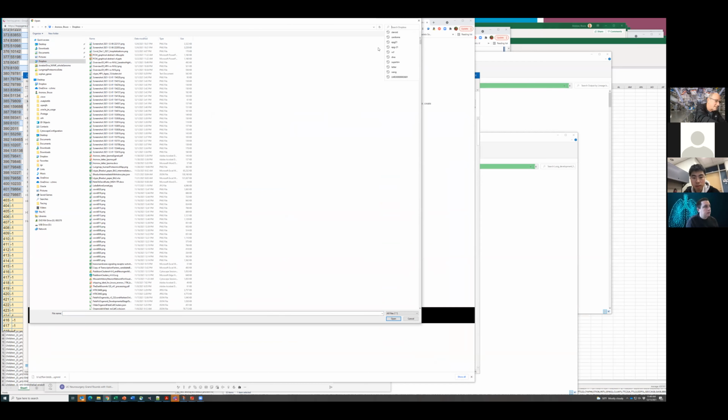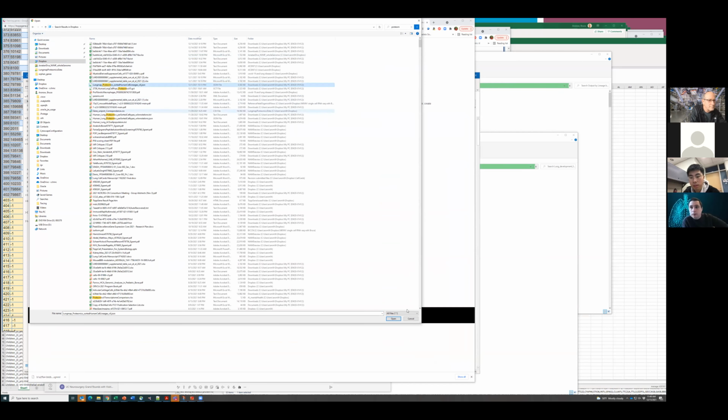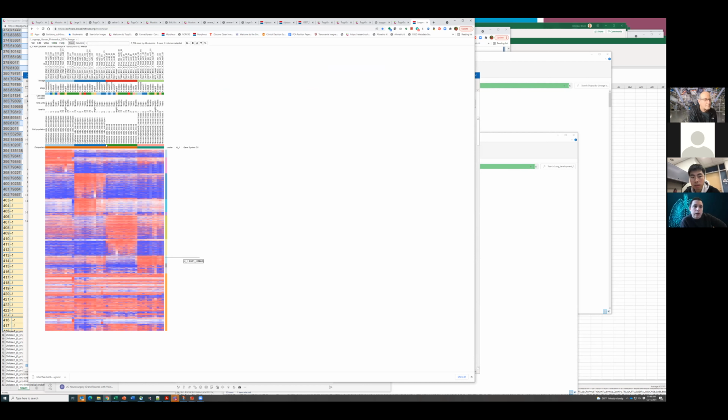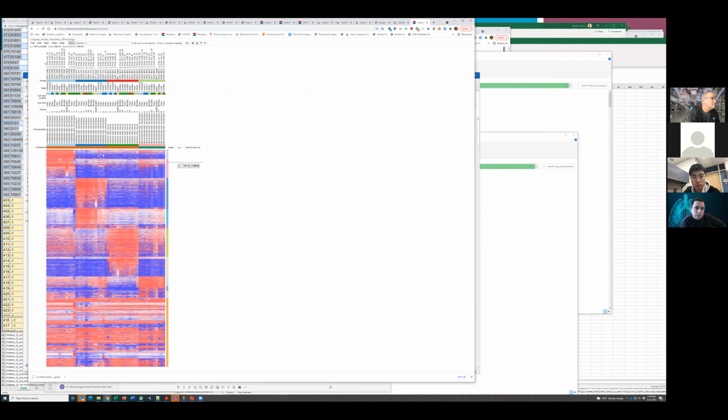As you guys get more and more, we already have lung exudate that comes from the intubation. And we will also have sorted cell types, proteomics, and lipidomics from donors with and without COVID.